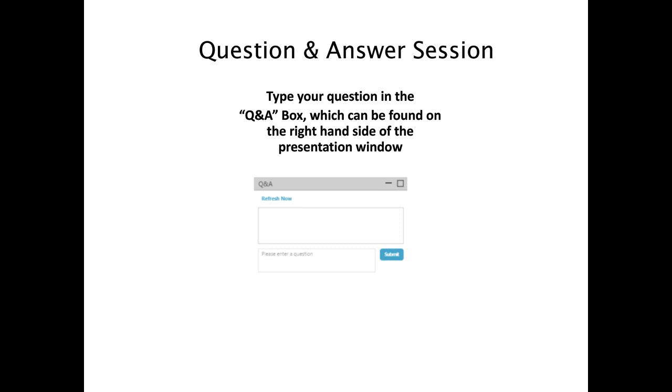Next question is, do you recommend to test PFP and C18 instead of C8 and C18 if you only have a chance to evaluate 2 columns for method development? The second part of that question is, are there any other advantages of PFP except for being more selective?